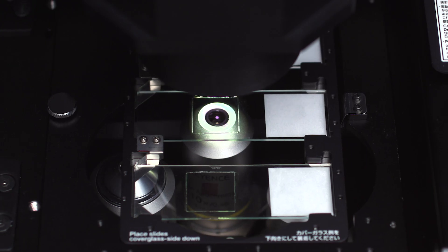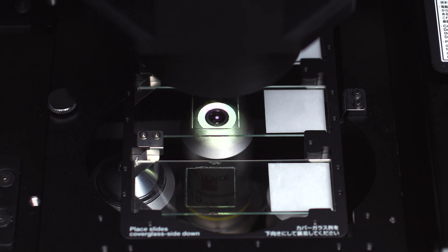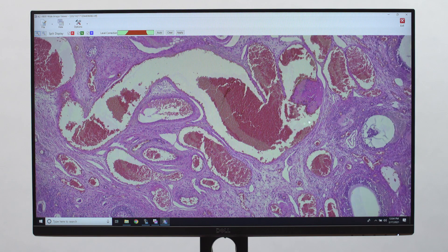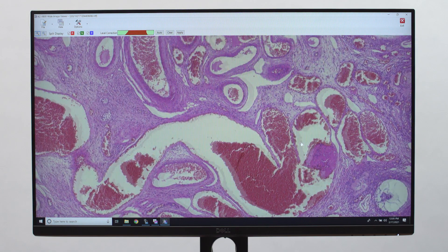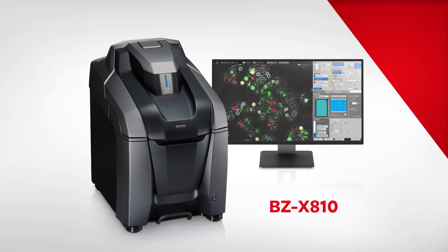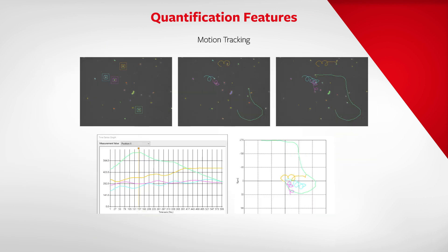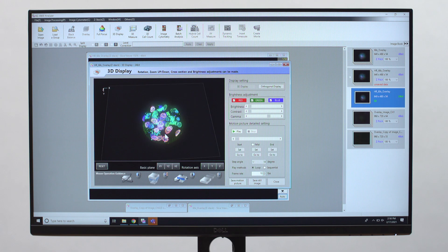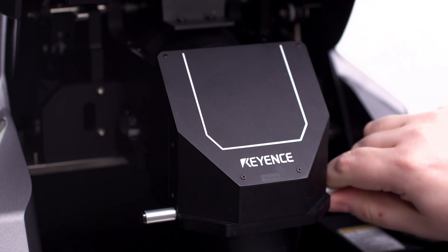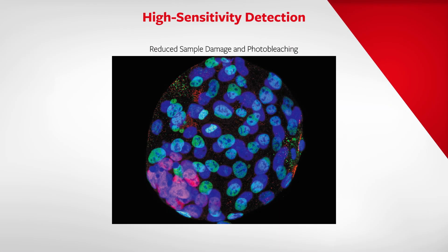Anyone from a novice to an expert can capture publication-quality images in seconds. The BZ-X incorporates in-depth quantification features such as cell counting, motion tracking, and 3D volumetric analysis. The high-resolution camera captures images with a strong signal-to-noise ratio for more accurate analysis.